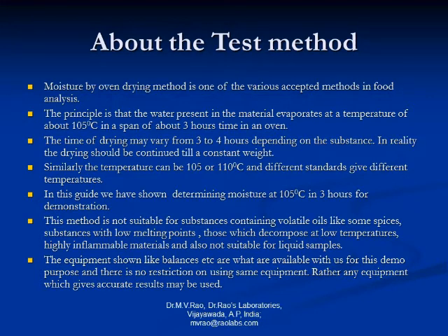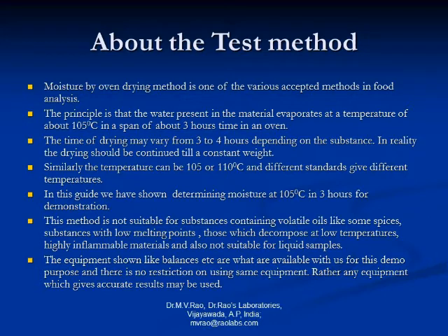In reality, the drying should be continued till a constant weight is obtained. Similarly, the temperature can be 105 degrees or 110 degrees centigrade, and different standards give different temperatures. In this guide, we have shown determination of moisture at 105 degrees in 3 hours for demonstration.